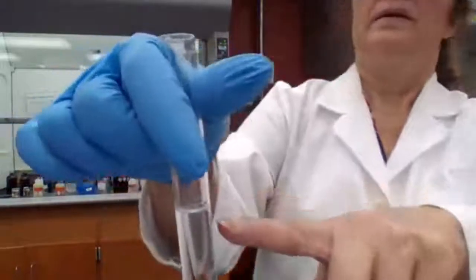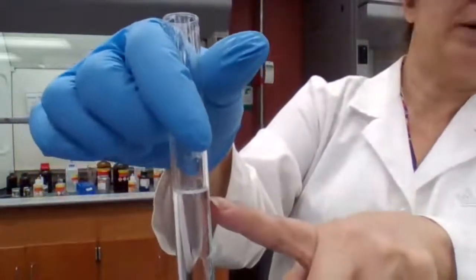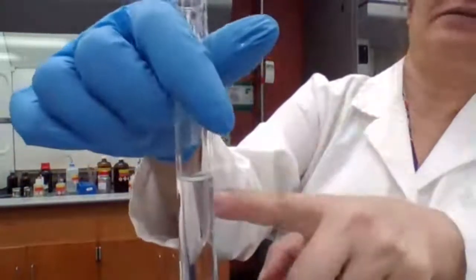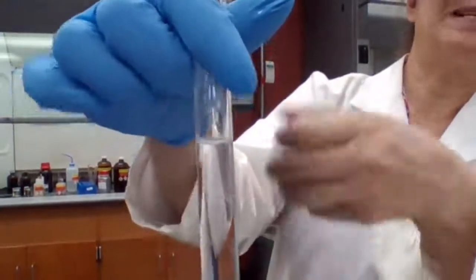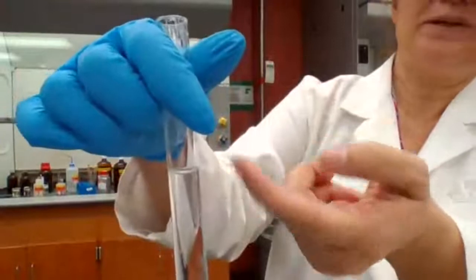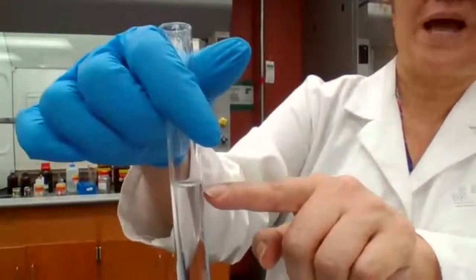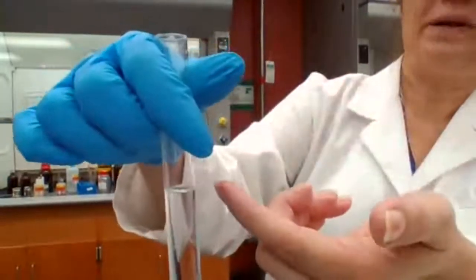Okay. Carboxylic acid with sodium bicarbonate, after how long? After like 30 minutes, everything is dissolved. So it's a slower reaction. But even if you didn't wait for 30 minutes for this reaction to take place, the formation of bubbles, which we had earlier, and it was continuously forming bubbles.